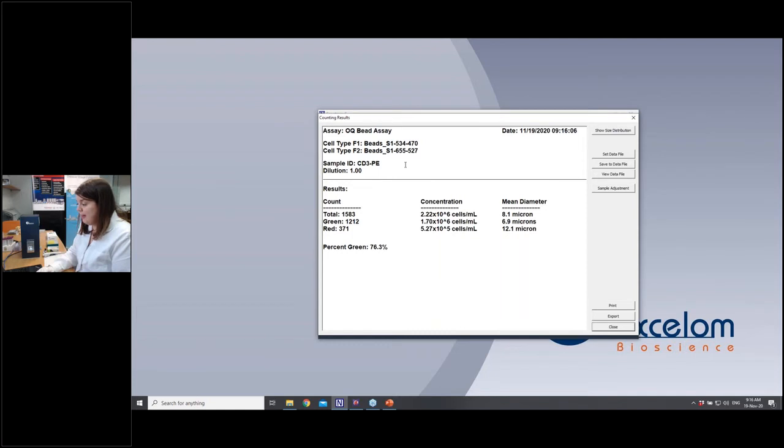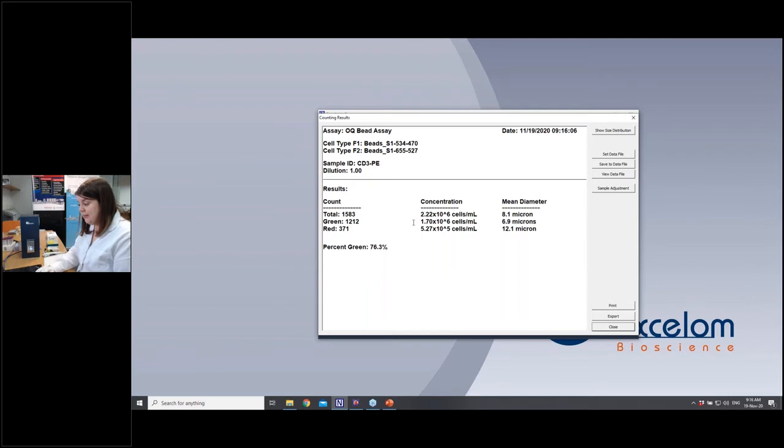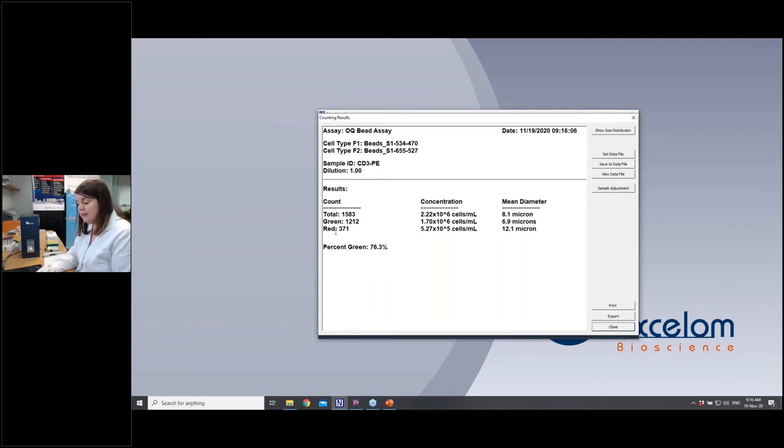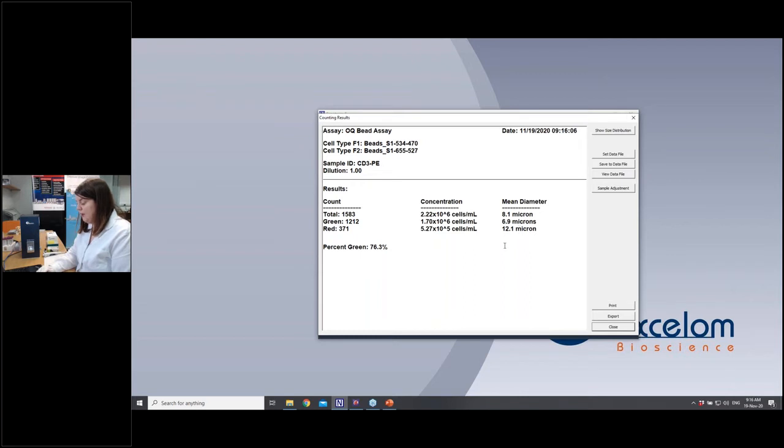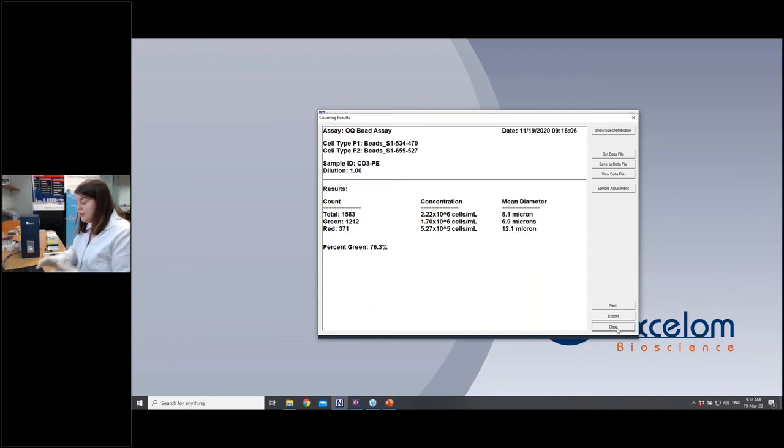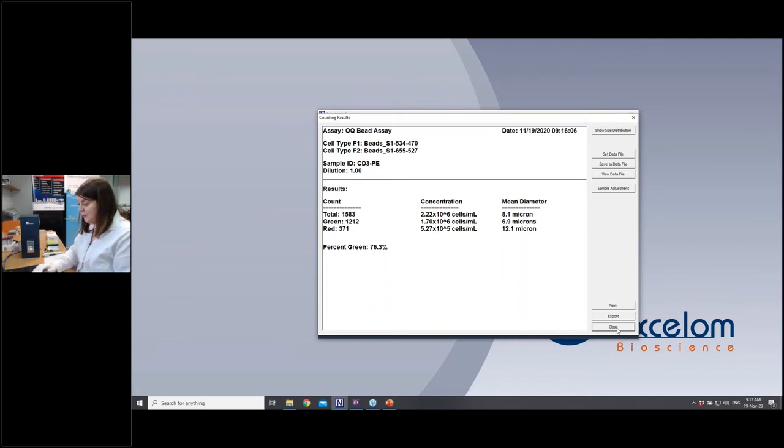So your results come up and look like this. This results page can be customized to look exactly how you want it to. This is the default setting. It will tell you the assay type you've used. It will give you a date and time stamp up here. It will also tell you the total number of beads, the total number of green and the total number of red, and it will give you a percentage. So if this was a viability assay, it will be live and dead and viability here. It also gives you concentrations and the diameter of those beads. Within this bead sample, the red beads are larger than the green beads. So we can see that the red population is of a higher diameter than the green.